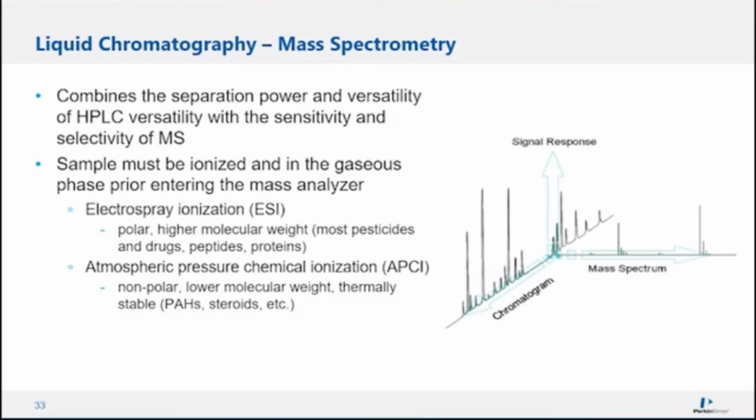That means that each peak in the chromatogram can generate a mass spectrum to give more refined structural data. More information with enhanced selectivity, specificity and sensitivity can be achieved by using a tandem mass spectrometer. In essence, the data generated by a mass spectrometer is similar to that of the contour map for the PDA, where we have 3 axes of data, except in this case, we have time, mass to charge ratio, and intensity. All this information can help resolve very complex mixtures of analytes.